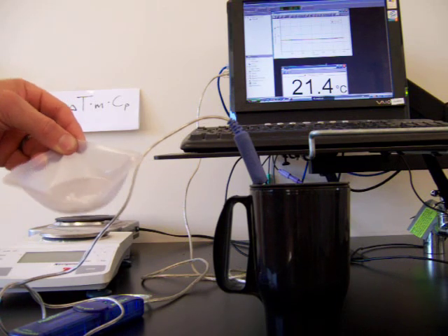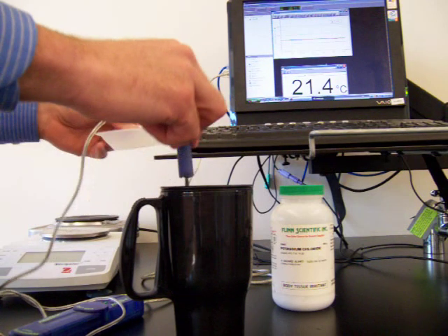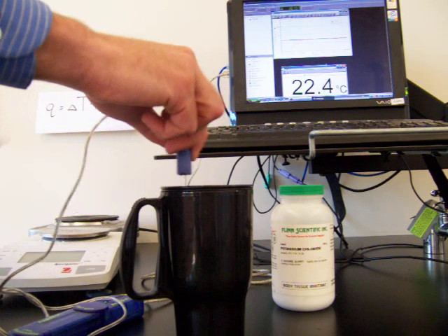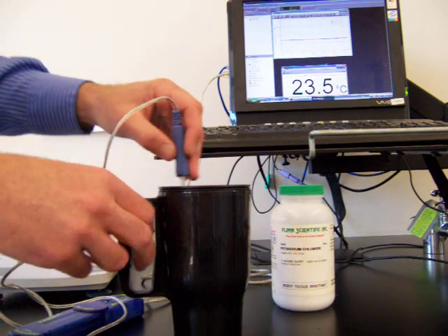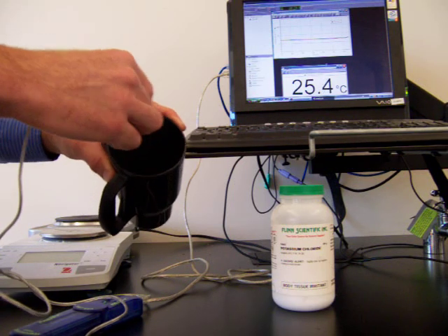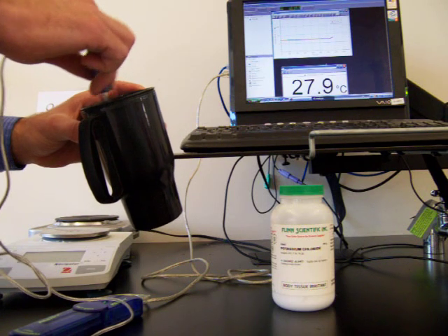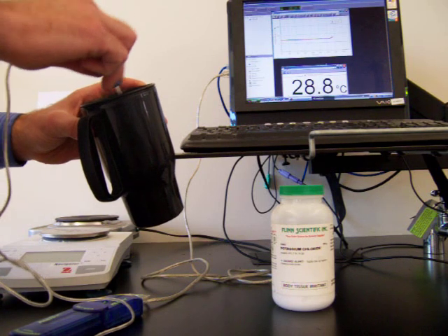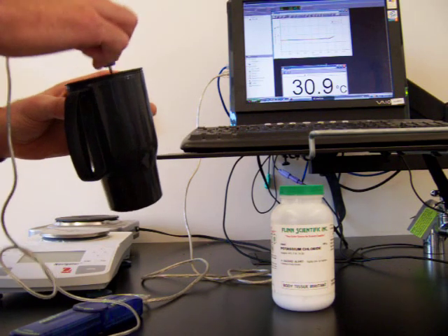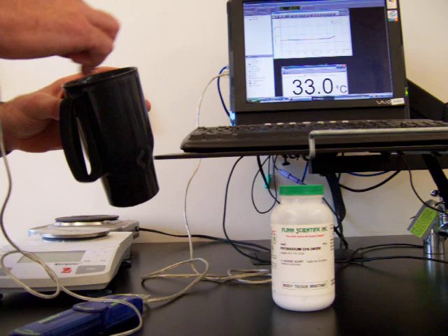Many ionic solids either absorb heat or give off heat as they dissolve in water. We're going to take our sodium hydroxide, pour it into our water, and stir. As it dissolves, we can see the temperature of the water is going up. There are still solid pieces of sodium hydroxide in the calorimeter, so we'll keep stirring. The temperature is going up quite a bit, so we can say this is an exothermic reaction.